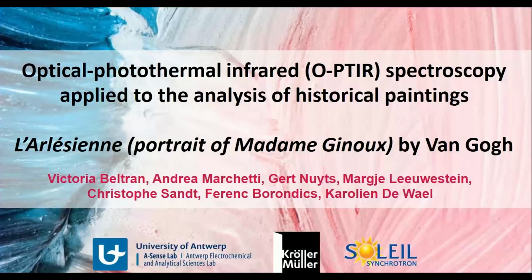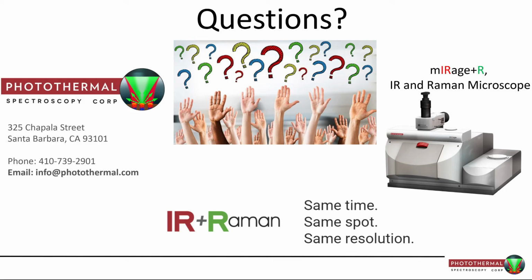Thank you, Victoria, for that really brilliant talk. As a product manager for this product line, it brings me great joy to see that it was only through O-PTIR that you were able to identify those layers that those other established techniques could not. So as you've been talking, I've been watching some of the questions come in. There are quite a few. I'll start with this first one here. Is there any radiation damage from the laser for the O-PTIR analysis?